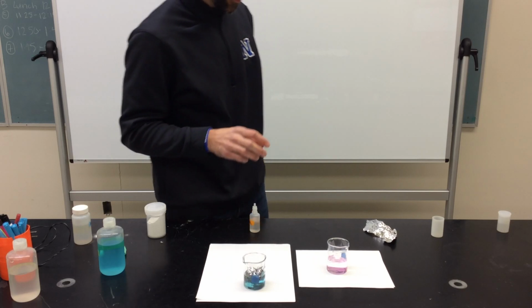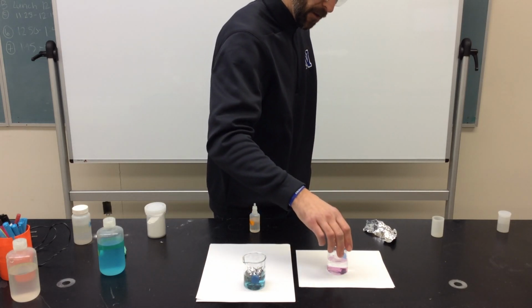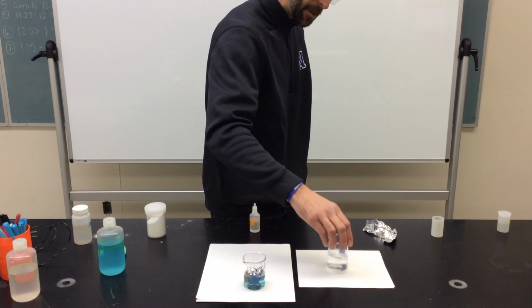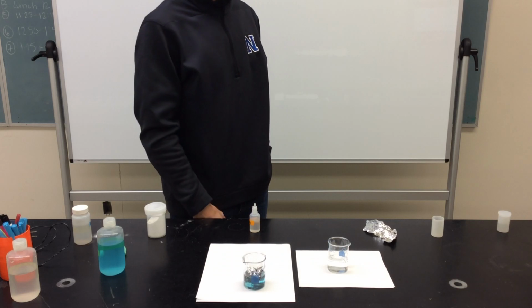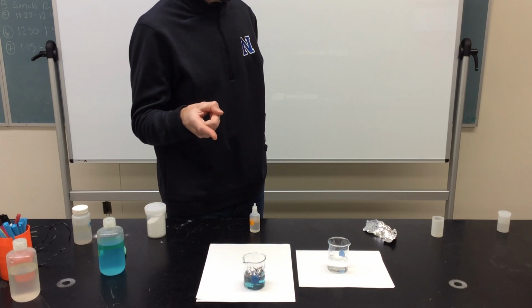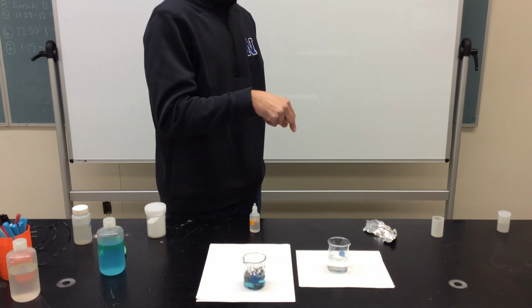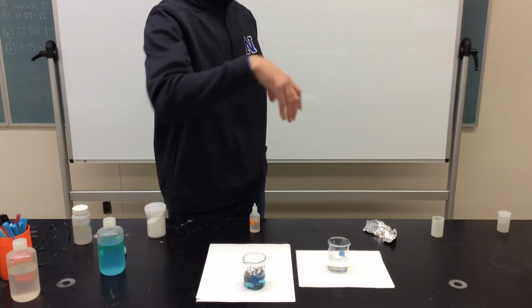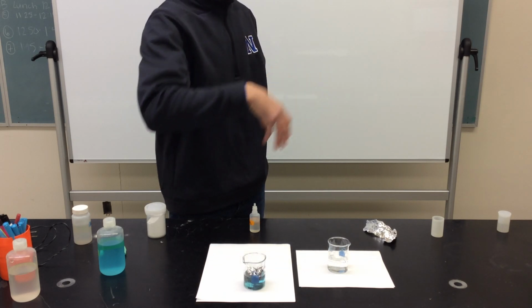Yeah, it turned purple real quick, right? So if I give it a little swirl, though, now it's a clear, colorless liquid. So it turns color, then I swirl it up, and then it goes back. By the way, that's a common chemistry technique. We call it the magic swirl. It makes things disappear.